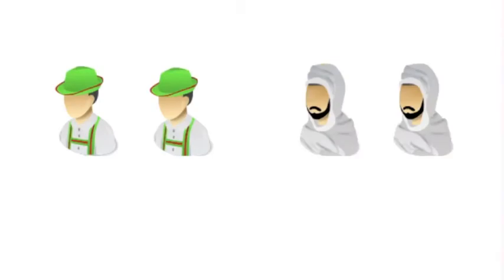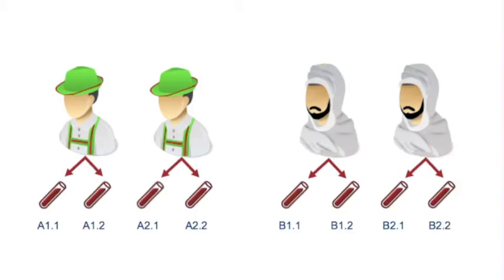The study had a pretty simple design and a nice set of conclusions. What we did is we took 4 individuals. Each of the pairs were identical twins, and from each one of the individuals we got 2 parallel blood draws. In addition, we knew that one of the twin pairs had a patient, twin B1, who had been afflicted by multiple sclerosis for over a 20-year disease course.